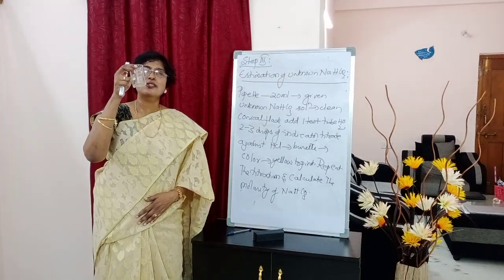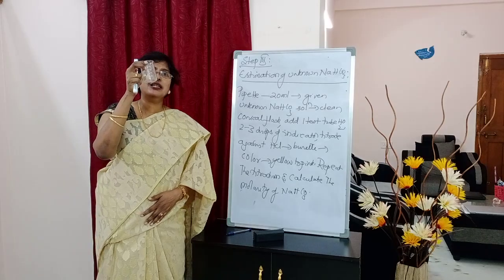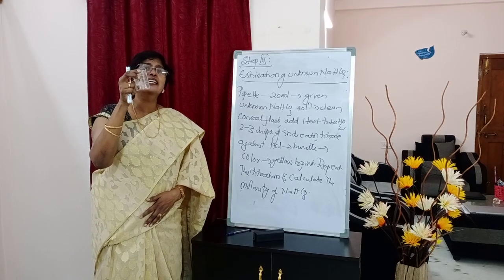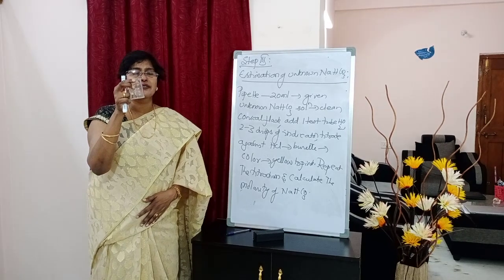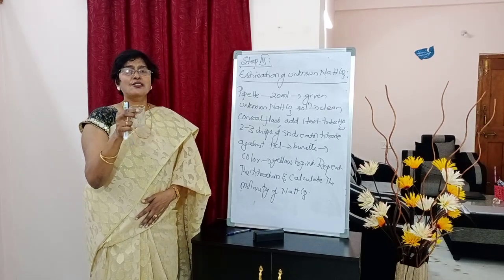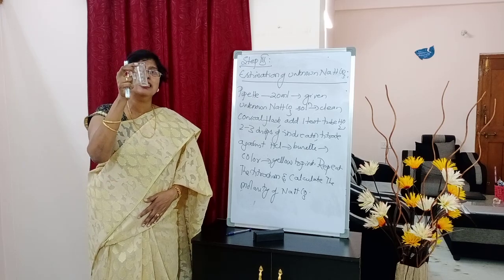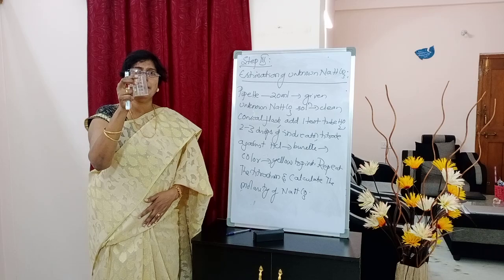Students, the unknown solution will be given in the beakers like this. Okay, and HCl also you will be getting in a beaker like this only. From the beaker you will be filling the solution into the burette. The unknown will be given in the small beaker. Okay, fine. So from this you will be pipetting out.